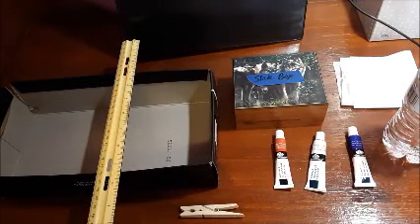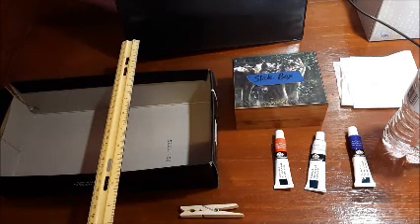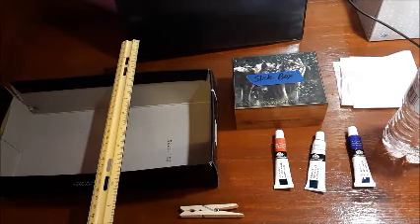Now, in order to do the acid-fast stain, you have to do it after gram staining. The reason behind this is that if the gram staining of our unknown bacteria was gram-positive, the acid-fast stain could be used because it has the ability to show us the differences between the two types of gram-positive bacterial cells. The two types include ones that have waxy mycolic acids in their cell walls, and gram-positive cells that do not.